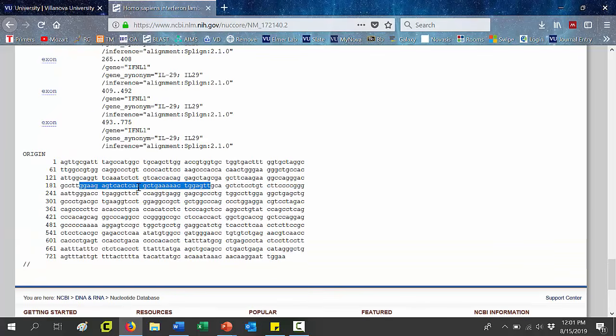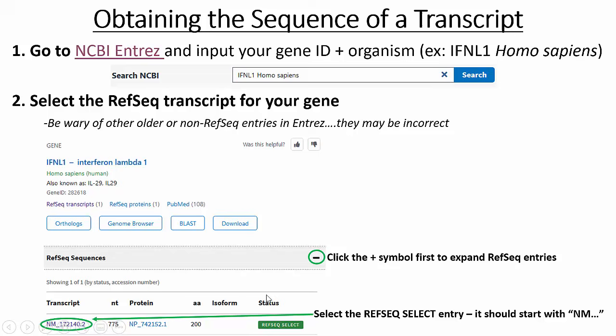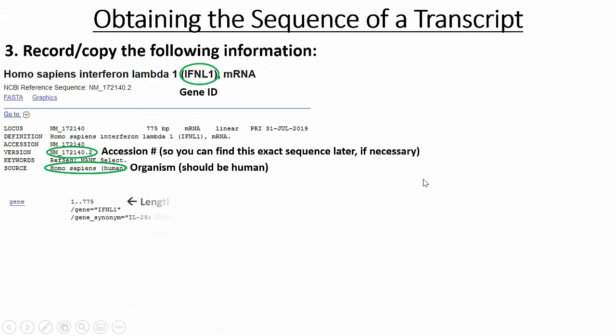Okay, so what I'd like you to do is copy that sequence and then let's go back to the PowerPoint presentation. So you can see everything that I've talked about so far is in here.